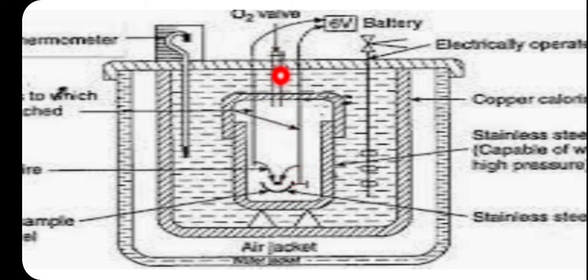Now in the bomb there is also an inlet, and this is the oxygen valve. This is for the addition of oxygen just before the start of the experiment. So we have already weighed the fuel, and this is the oxygen inlet tube. Now this bomb is immersed into a solution. This is filled with water, and before the start of the experiment, again the weight of this chamber is taken. Then in this chamber we have a stirrer. This stirrer is there to move the water so that the heat that is released mixes and the heating is uniform.